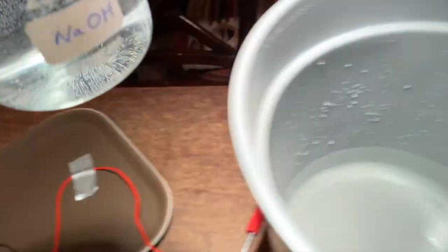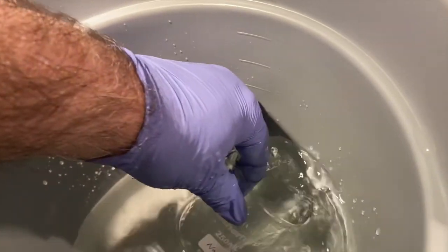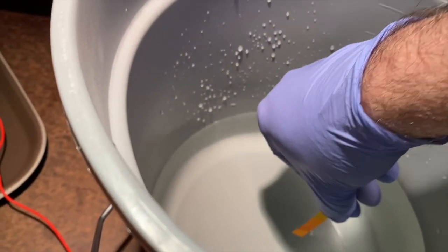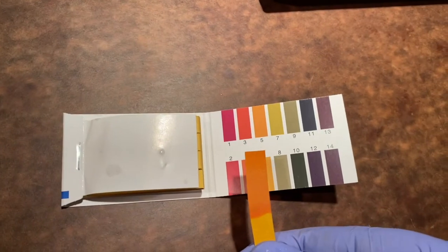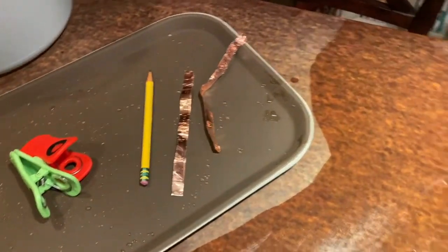Finally, we want to neutralize our electrolyte solution in the vinegar and verify that the solution remains weakly acidic before dumping it down the drain. We also want to clean up our workspace completely, leaving no remaining hazards for others.